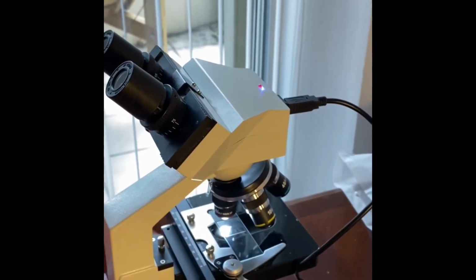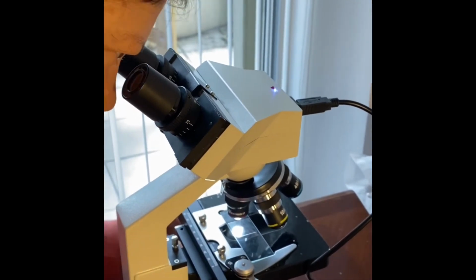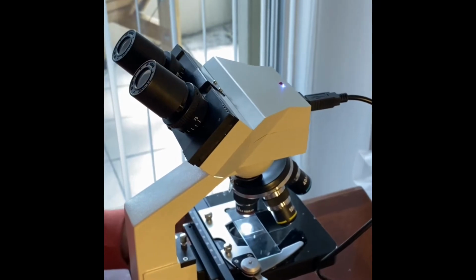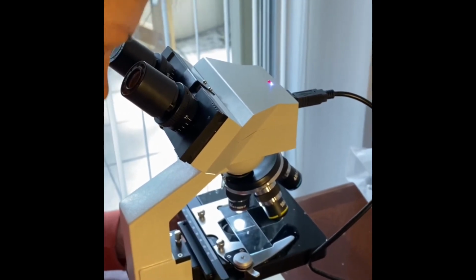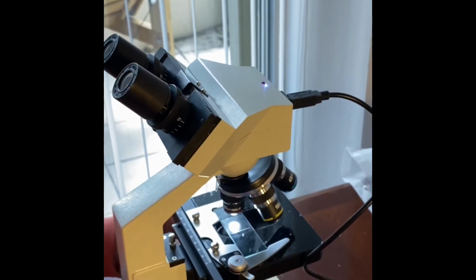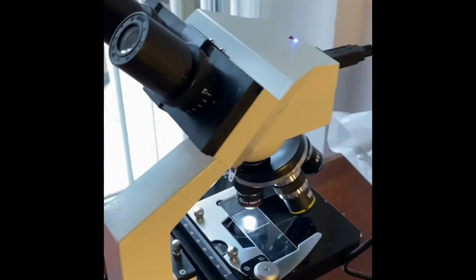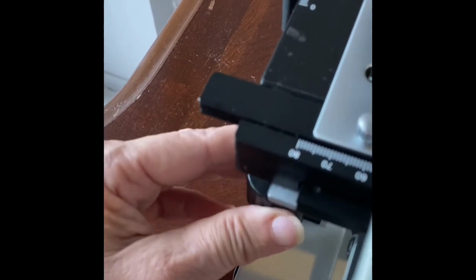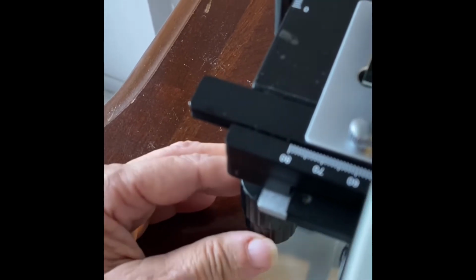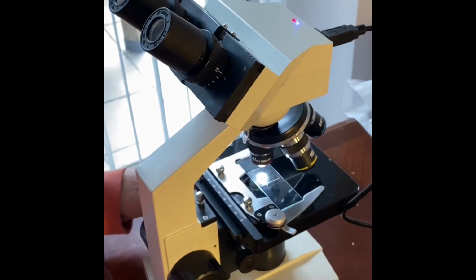You move it back and forth to get it centered, and you look for it, and it goes up and down with the adjustment on the left side of the microscope.